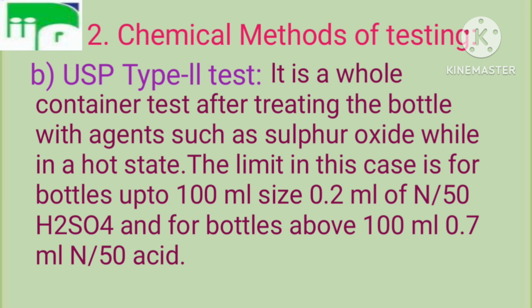USP type 2 test. It is a whole container test after treating the bottle with agents such as sulfur oxide while in a hot state. The limit in this case is, for bottles up to 100 ml capacity, 0.2 ml of N/50 H2SO4, and for bottles above 100 ml size, 0.7 ml of N/50 H2SO4 acid.